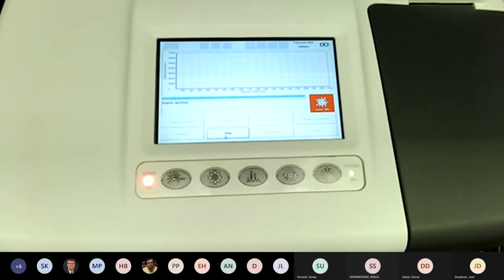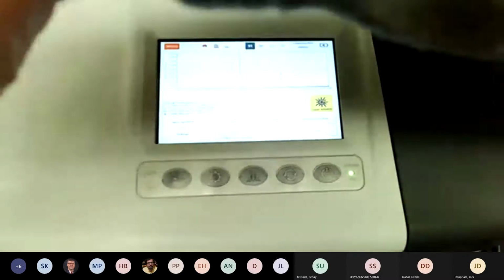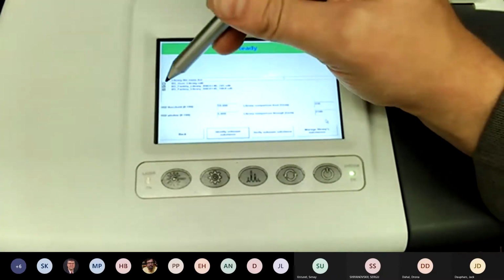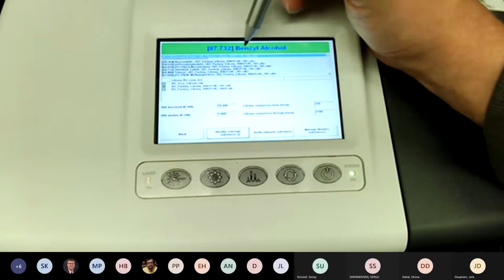This worked perfectly when we did it 20 minutes ago. Of course. Turn off this library. It's still saying something's off.